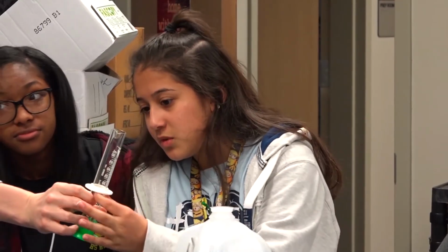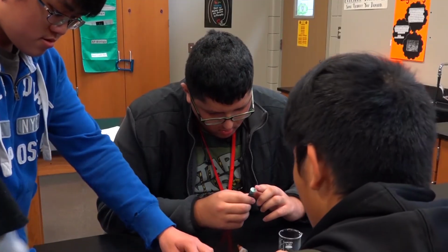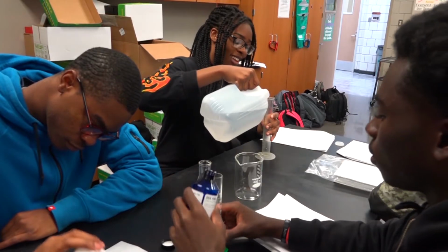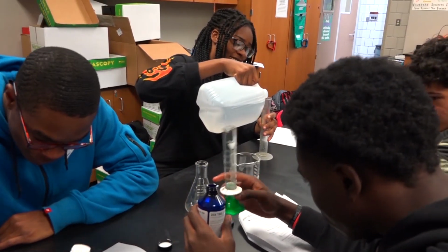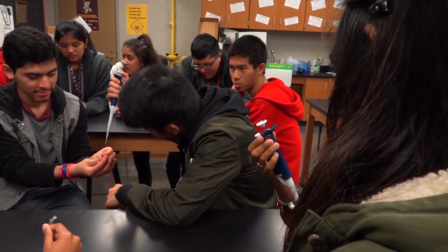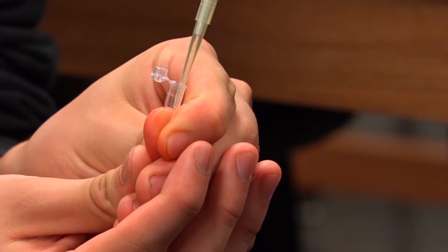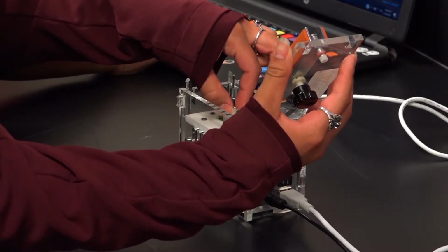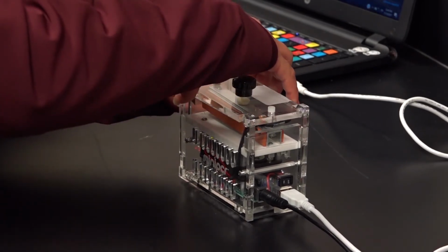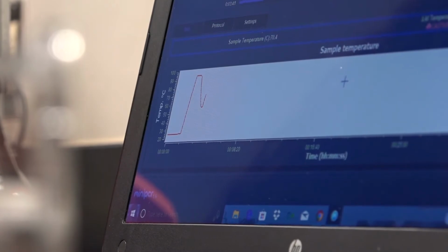Her commitment paid off. The advanced biology students were able to do an experiment with the PCR machines. The scenario? Which food on the space station might be giving astronauts food poisoning? You go through the process of taking out the sample and placing it into the PCR tubes. And then from there, you could put it into the mini PCR machine. It takes about 15 to 30 minutes to get the samples, and then you put it into gel.